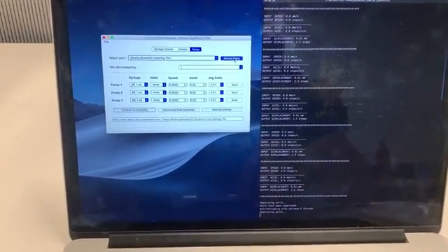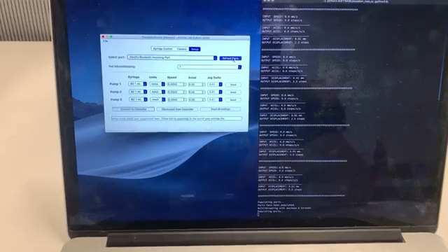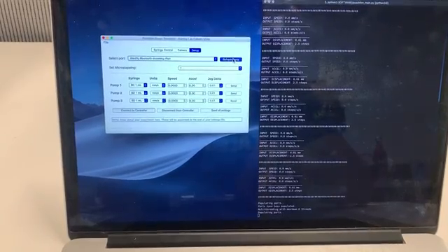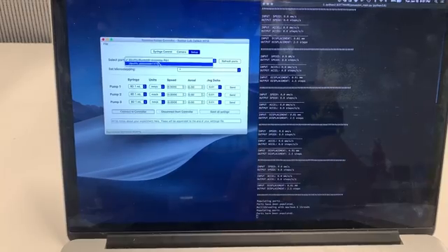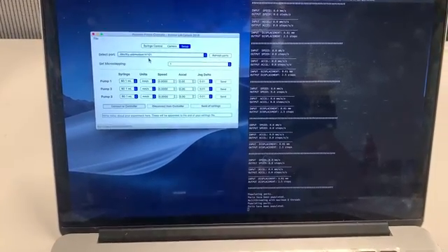If we click Refresh Ports, we look down and that's where my Arduino is connected. So I'll select that port.